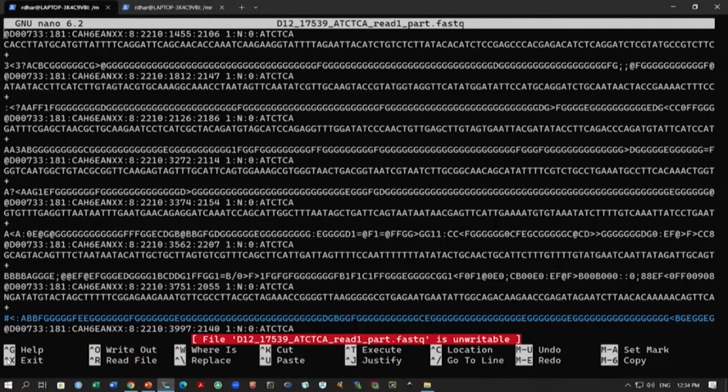You see this sign, but this actually means control. So, you have to use control plus x to exit. If you want to write out, or read, it is control R. If you want to cut or paste, you have control K, control U, and many different options.